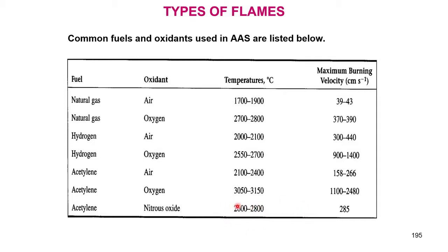So, in normal atomic absorption spectrometers, for low temperature routine analysis they go for air acetylene combination, and for refractory elements like tungsten, chromium, vanadium and many other elements, aluminum for example, that is also a refractory element.